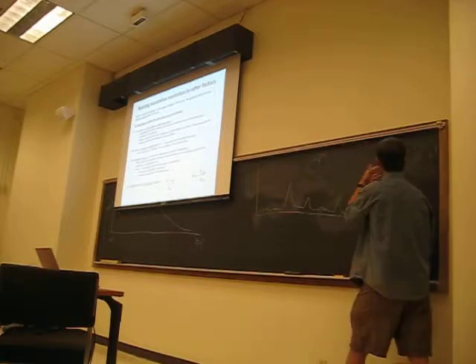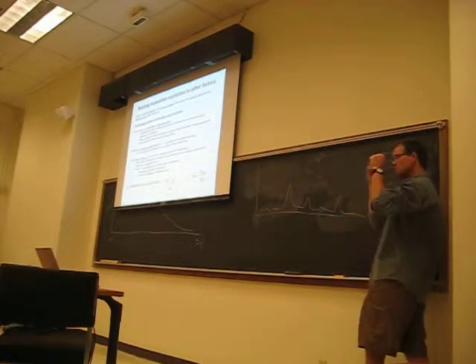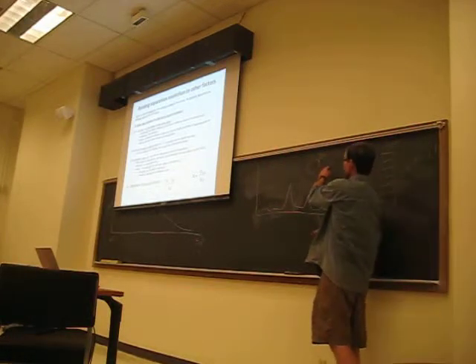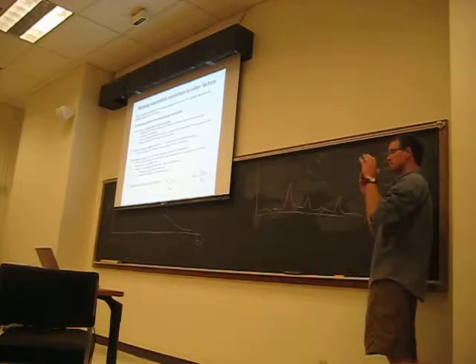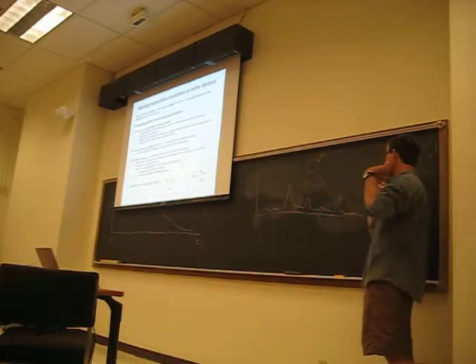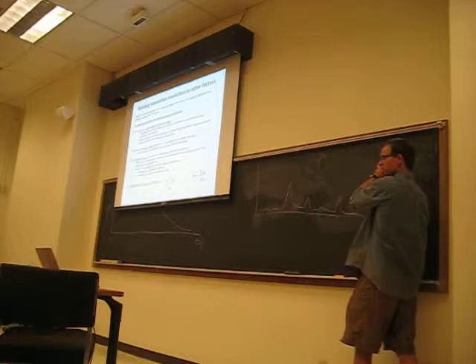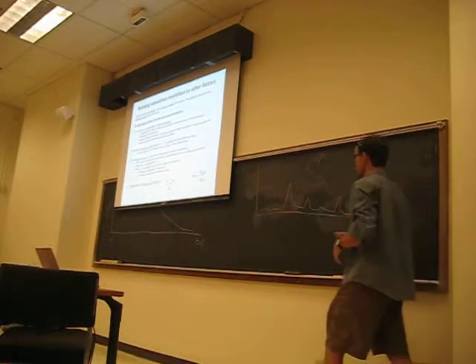The only difference is that here we're ascribing some theoretical physical dimension to this, when in reality it doesn't actually have that kind of physical dimension. But how analytes partition onto the solid stationary phase can be explained with the plate theory, in terms of these theoretical plates.